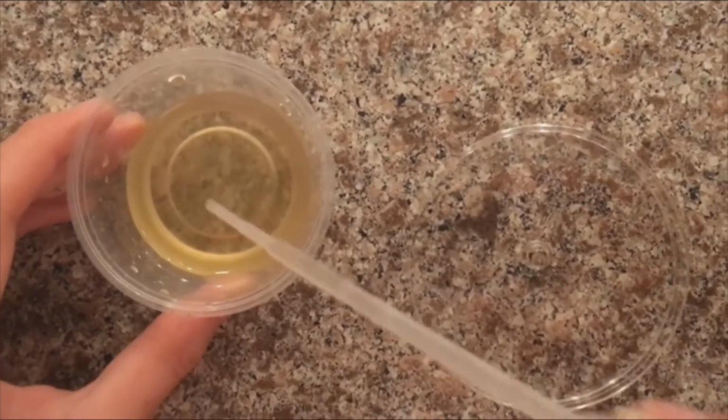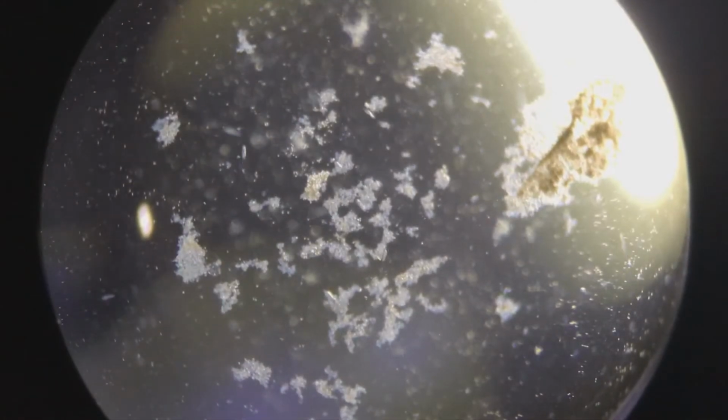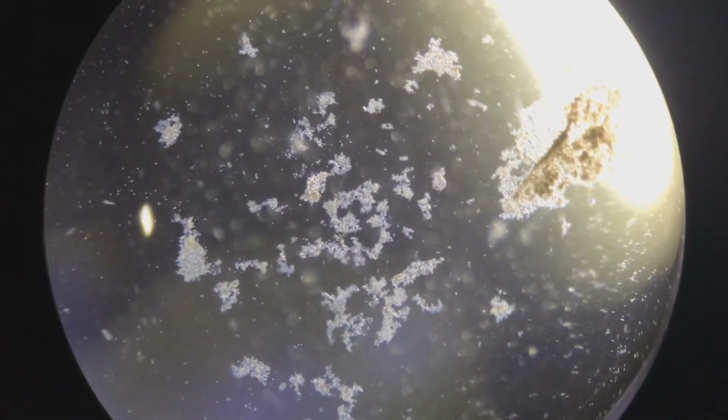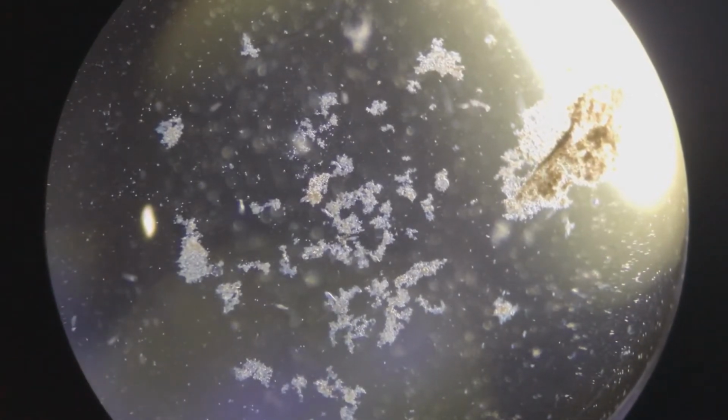Both the pipette and the petri dish were then washed out with distilled water and dried. The plastic cup was then capped and returned to its environment of indirect sunlight. This process was repeated for the rest of the plastic cups.